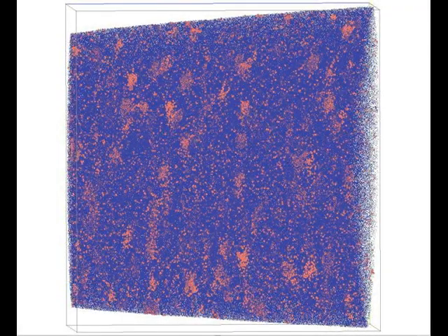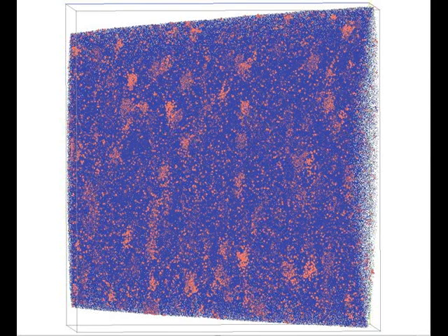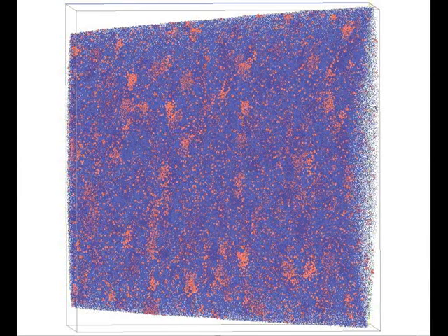This is a 3D atom probe sample. It's an iron alloy. Most of the atoms are iron, shown here in blue. We take those away, and these are the minority components that are left.